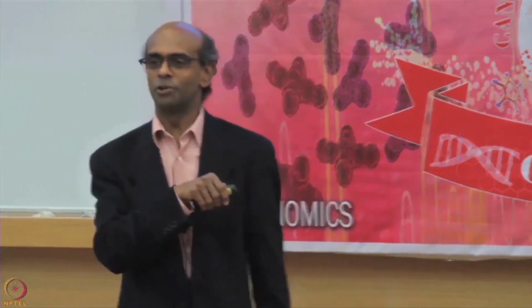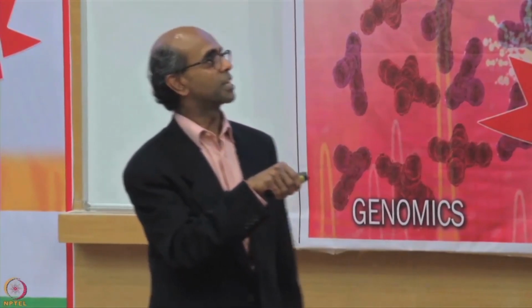So these things you have to be a little more careful. You can't just throw it away. But the most worrisome part is missing not at random. Unfortunately, most proteomics data is missing not at random. Missing not at random means the missing value depends on the missing data. In other words, it's missing when the value is some specific thing. If your intensity is less than some count, the data is missing. So that is missing not at random, and that is the most worrisome type of data.